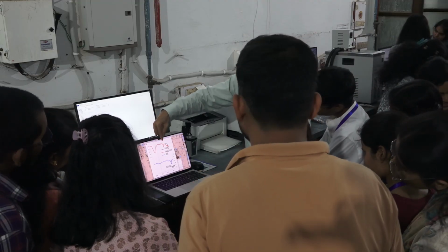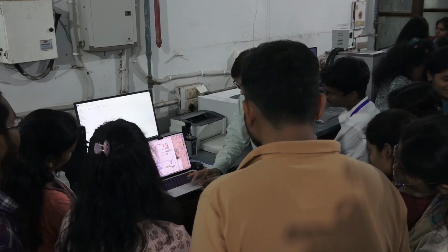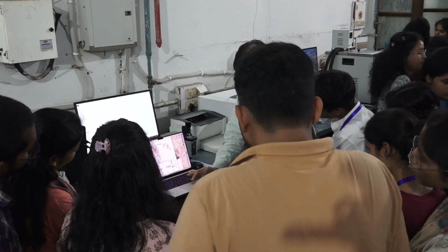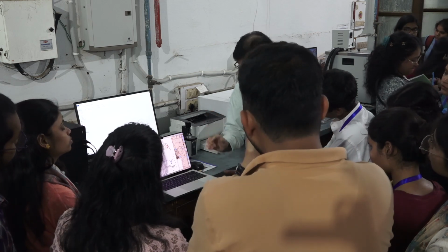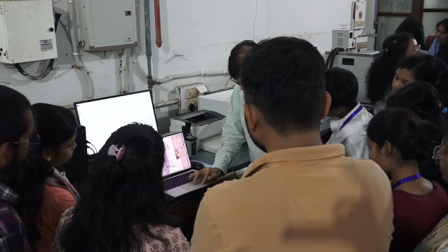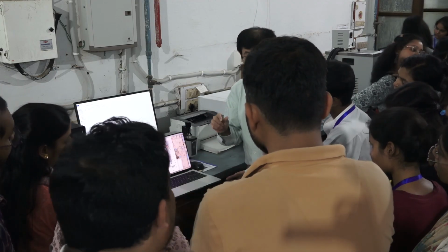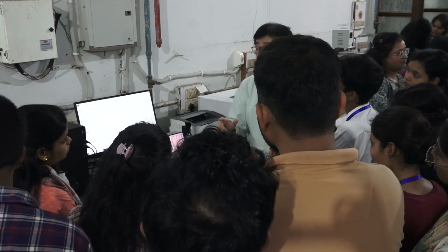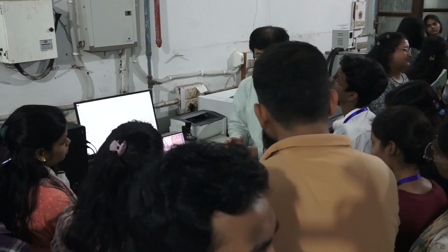Okay, and here this term. Here is a peak, probably 1450 or somewhere. This is CH bending, and I'm not sure. One of these peaks should be CO stretching, or there must be COC bending, or some other vibrational mode must appear here.